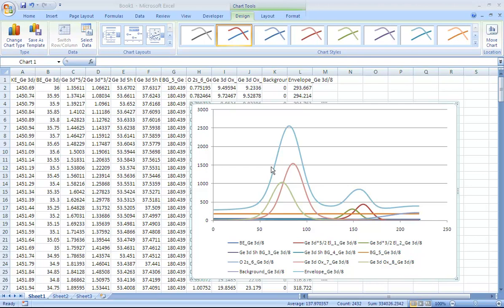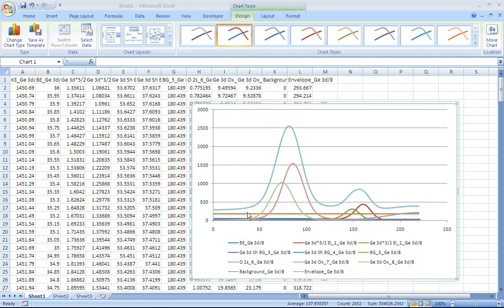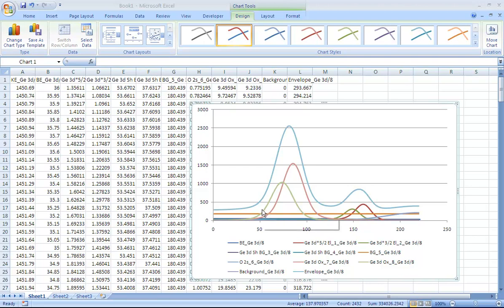Now in this case the peak model is constructed from more than just bell-shaped curves representing photo emission peaks. There are components within the peak model that represent background. So if we simply export components in this form, the plot within Excel requires further work if we want to plot a set of peaks above a background signal where we have to calculate a background from a set of components.